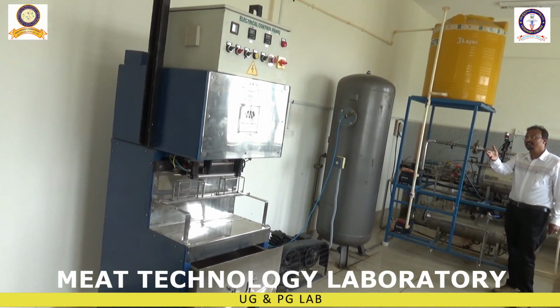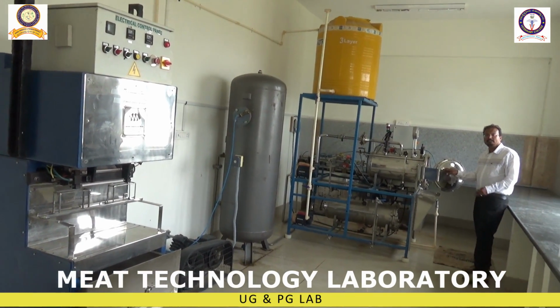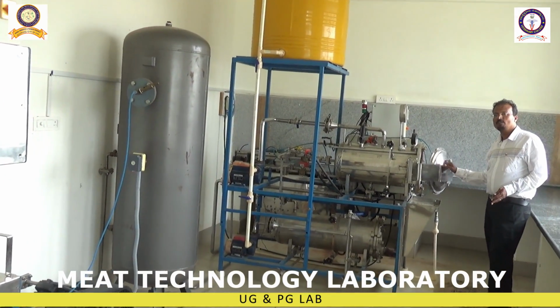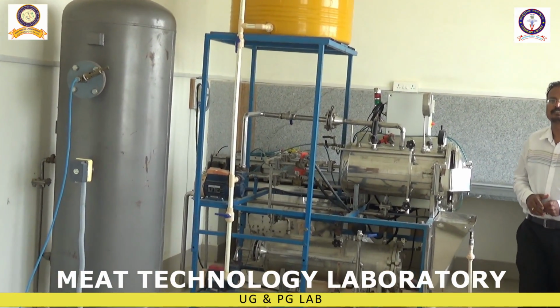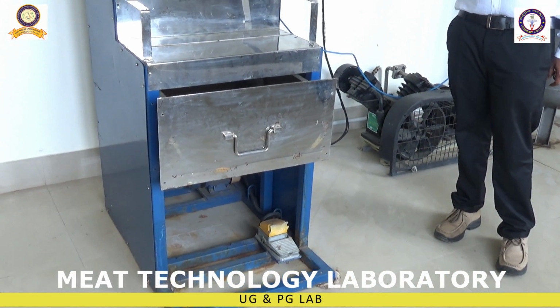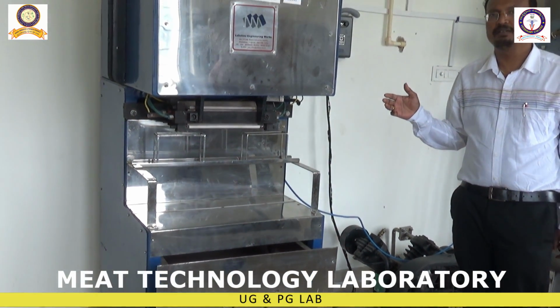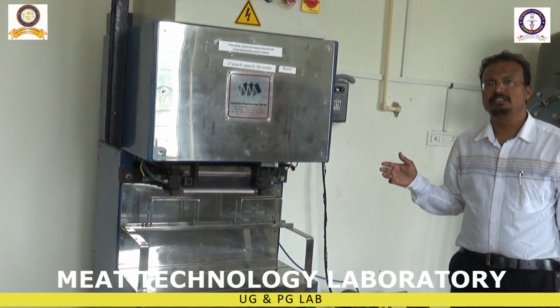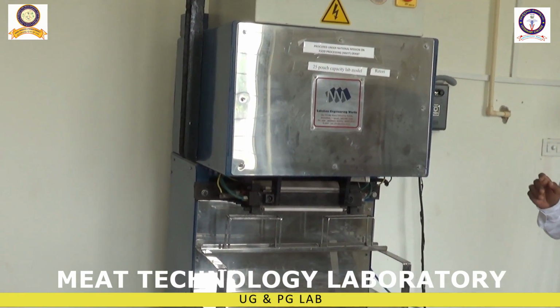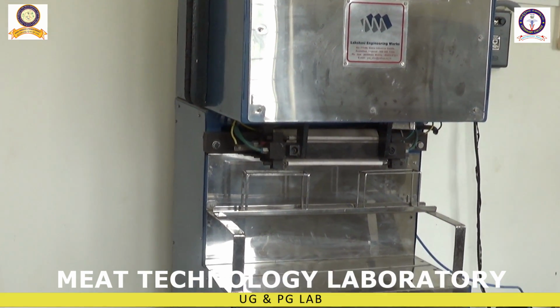Once a curry is packed in pouches, you have to process it in this instrument. After processing, you can keep the product at room temperature for more than 1 year. By using this technology, you can process pouches having curry-like products, and after processing you can keep the product without refrigeration at room temperature for 1 or 2 years. That is the beauty of this instrument.